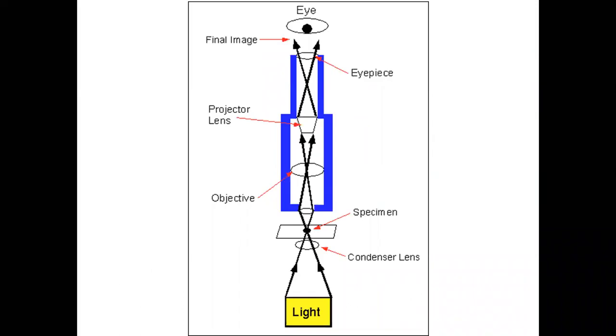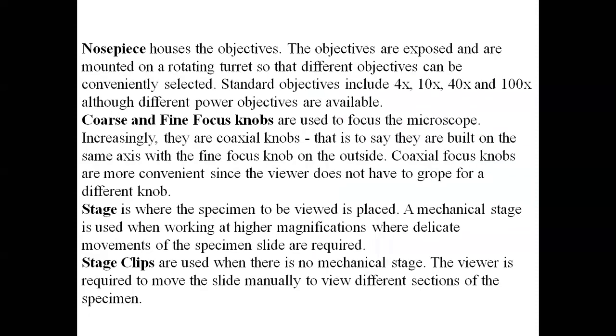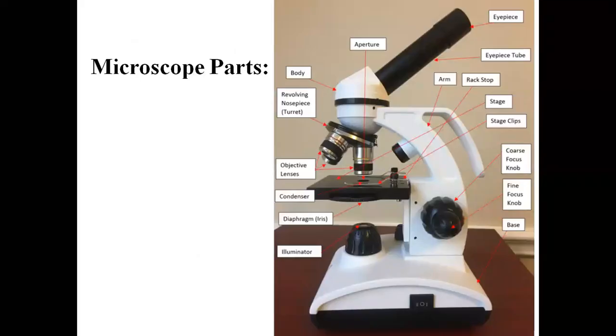Okay, so for today, just remember how the light is traveling inside the microscope, what are the different parts of the microscope, and what is their function, and how the microscope works. That is the basic. So for today, we'll end with this, and later on we'll continue with your dark field and bright field microscopy. Okay. So for today, thank you all.